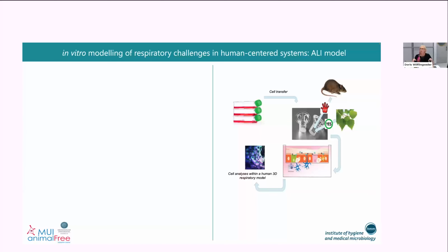And so we compared the growth and differentiation of those primary epithelial cells directly in parallel in rat tail collagen versus the birch-based cellulose, and really characterized the proliferation as well as the differentiation of such cultured cells in detail to get standardized conditions. And in the end, we found that within the birch-based cellulose, the cells differentiated faster, so we could use them faster for our experiments.